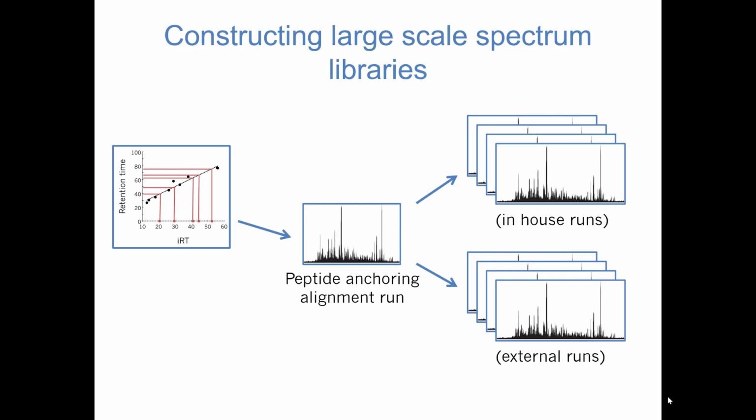How much of a retention time shift is acceptable for you when you look at your data? It depends on what I'm going after. If I'm looking at DDA data, I typically expect around a 5-minute retention time shift, especially if I'm using different chromatographic conditions and different potential matrices. For example, if I build a background on HeLa and I'm analyzing MCF7, it's a different matrix, so I might make different calls. Or for fractionated samples, yeah.